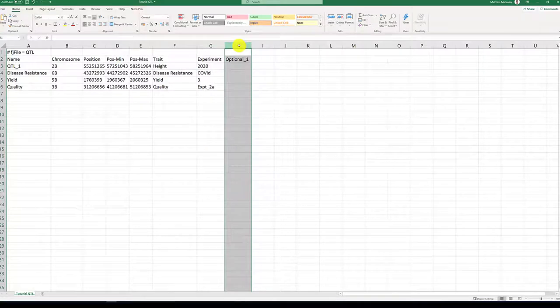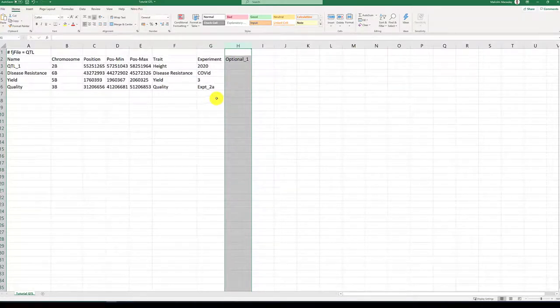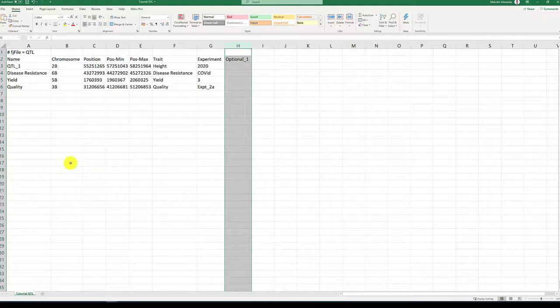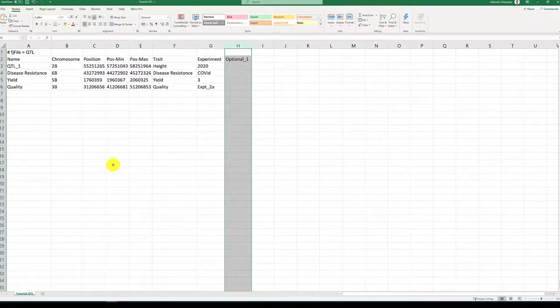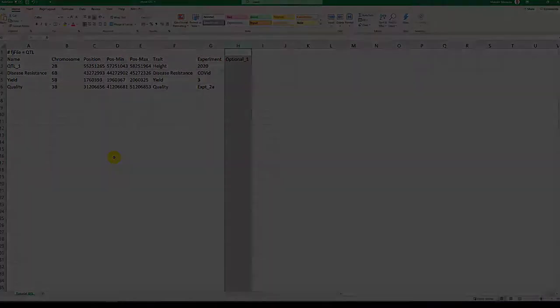Additional information can be added to also enhance your analysis. We are now at the stage where we can create a Flapjack project. In the next tutorial we will look at importing your data.